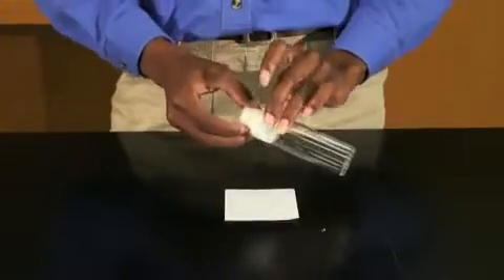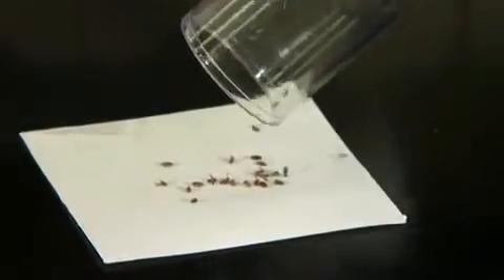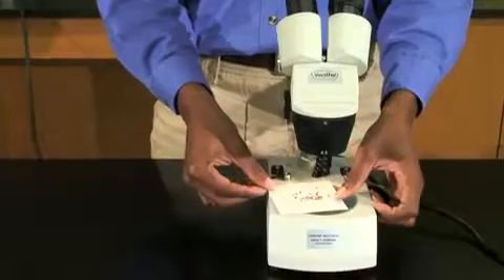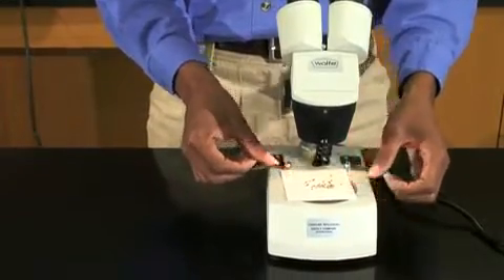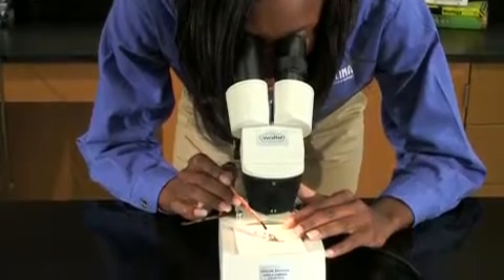Remove the plug from the vial of sleeping flies and tap them onto the sorting card. Place the sorting card on the stage of the stereoscope with the power as low as it can be. Using a fine brush, sort the flies into groups of males and females.